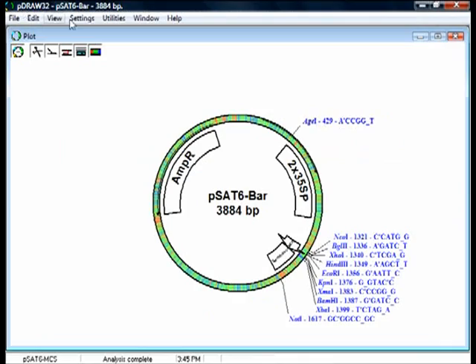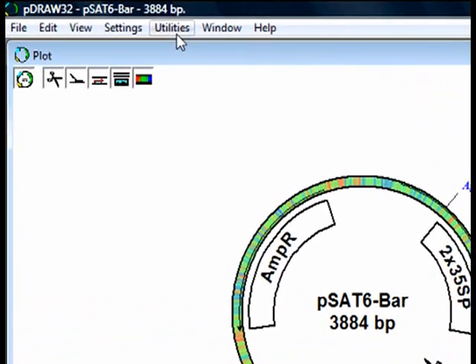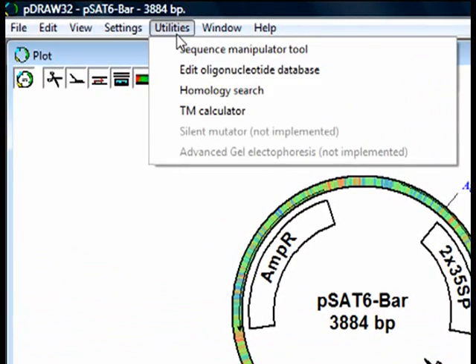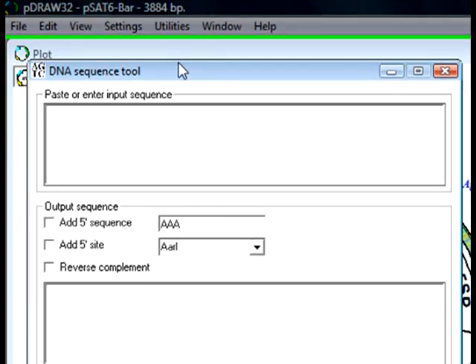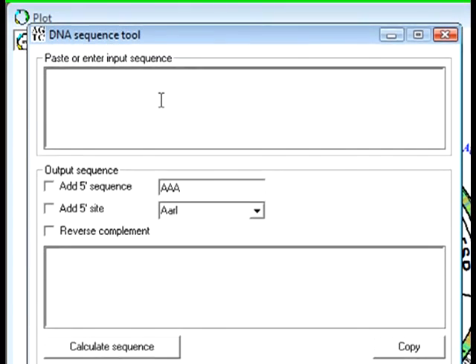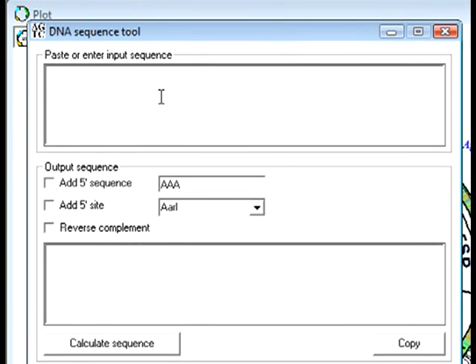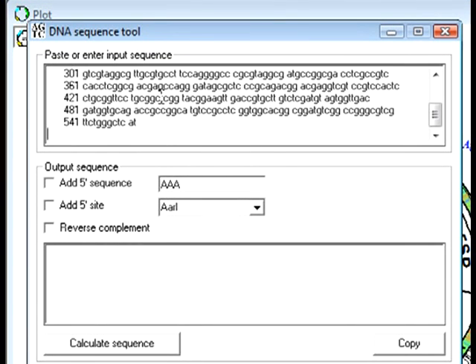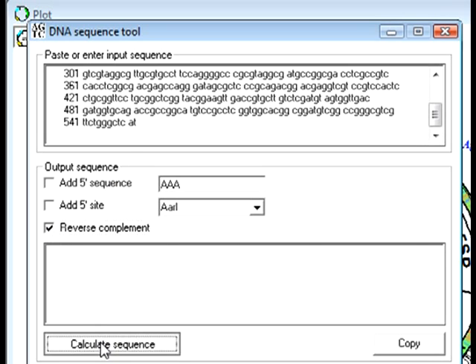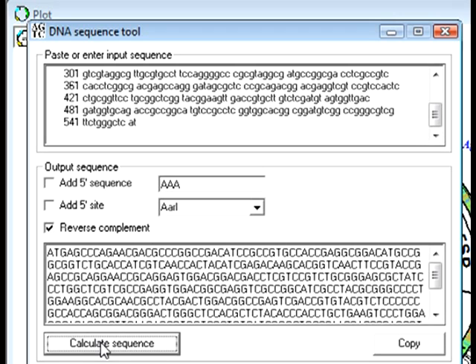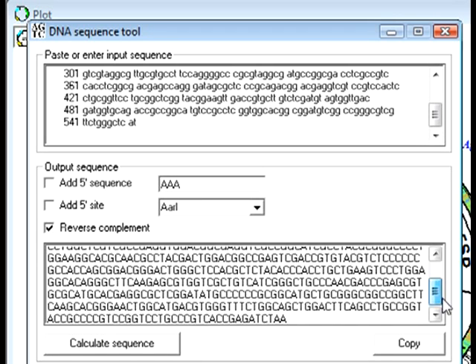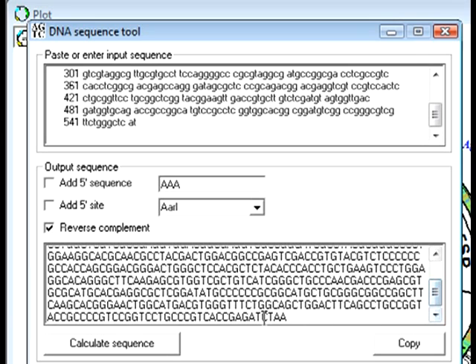In P-Draw32, I want to change its orientation by using a utility called Sequence Manipulation tool. I paste here my sequence, select Reverse Complement option and calculate the sequence. Here is the sequence of the bar gene, starting with ATG and ending with a stop codon. I am going to copy it and hide this window for now.